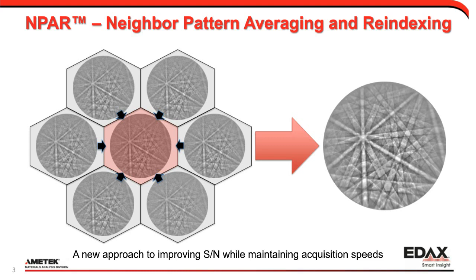You take 2 or 3 or 5 patterns from the same point, average them together, and then move on. While doing this would also increase your collection time. If I take double the amount of patterns, I just double my collection time. Now, we all know with EBSD maps, you can have a very long map, and doubling a very long time makes it even longer.